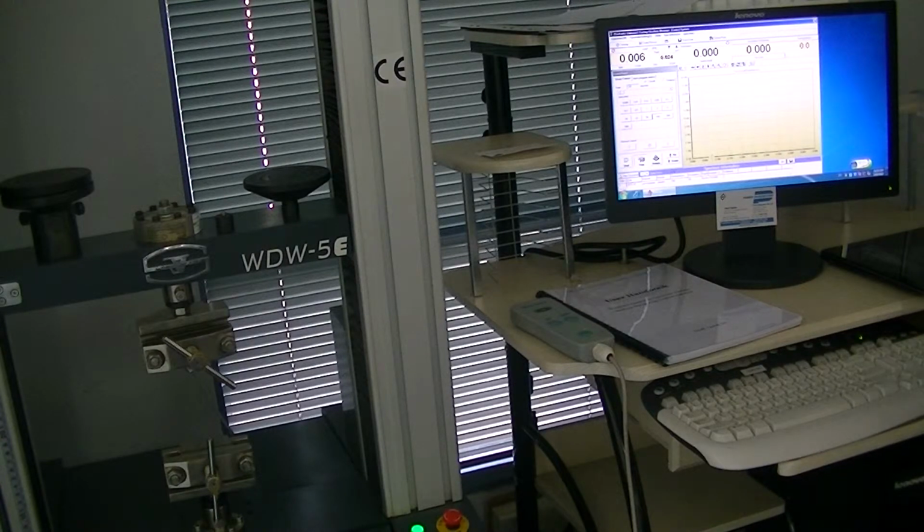It says you can scroll up or down sample numbers. That is here, scrolling up or down sample numbers. So you can see at the bottom number 1 or number 2. Sample 1 is the first sample we want to do. So you need to ensure that you're on order number 1, sample number 1. Okay. If you're on sample number 2, as you can see here, go back to sample number 1.